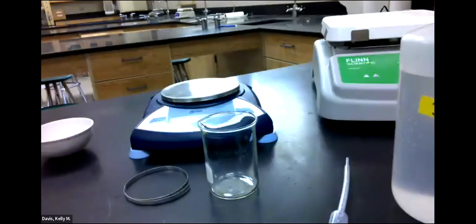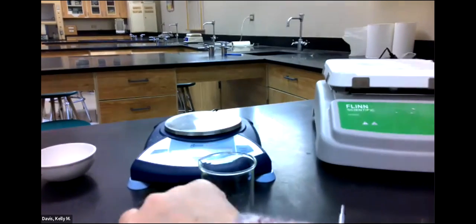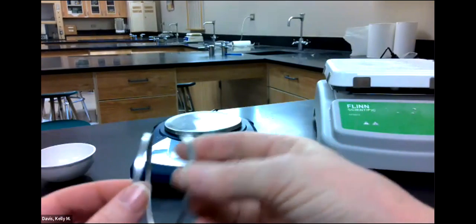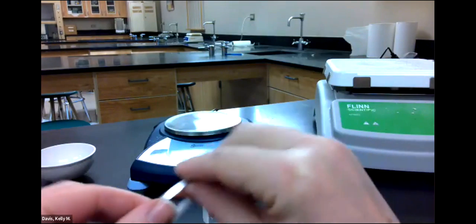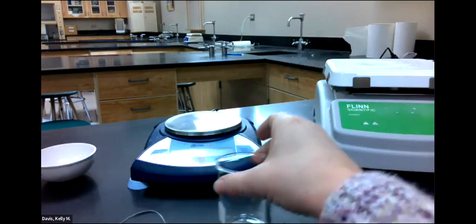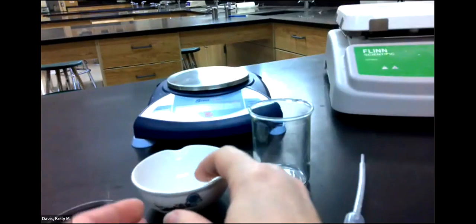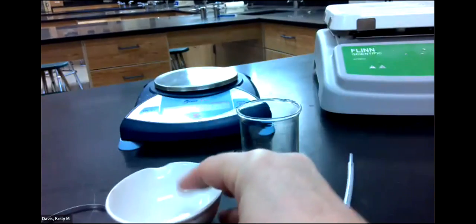All right, so here we are, the stuff that we have and we'll need. We have magnesium metal, typical magnesium we've used for a few things this year. I have already sanded off the magnesium, to make sure it doesn't have any rust or oxidation, so it's pretty clean, just pure magnesium. And we have an evaporating dish, which we're going to use at the end to evaporate off the water. Because we're going to have our solid left in the evaporating dish, we're going to get the mass of the evaporating dish. Let me move this so you can see it.